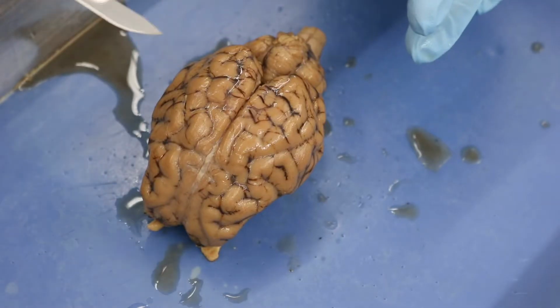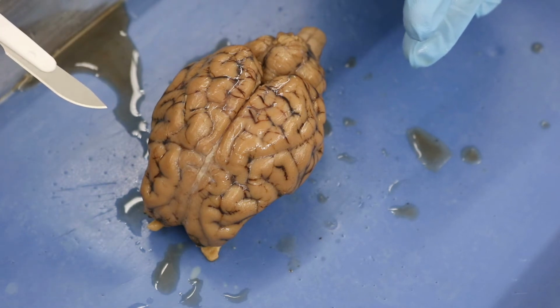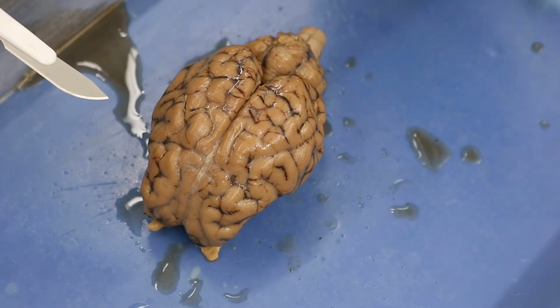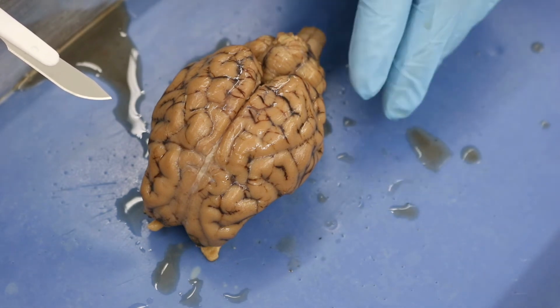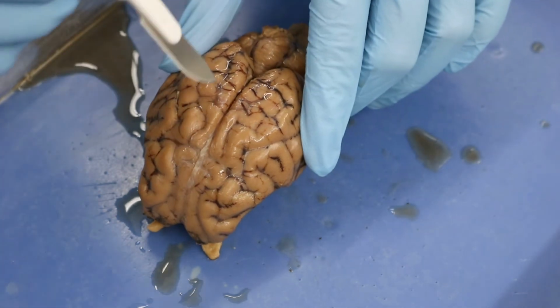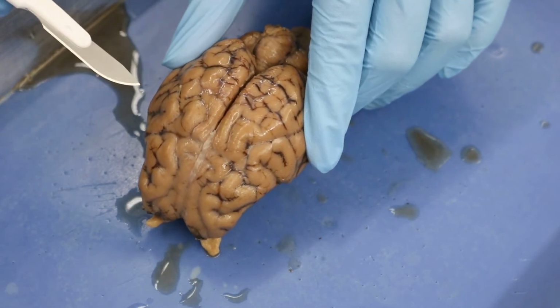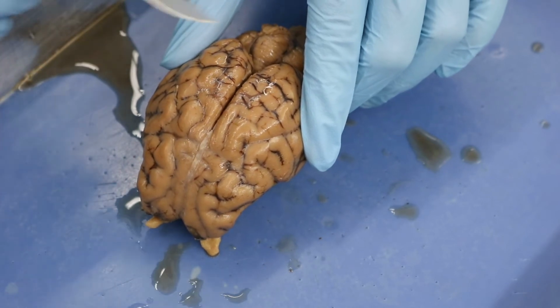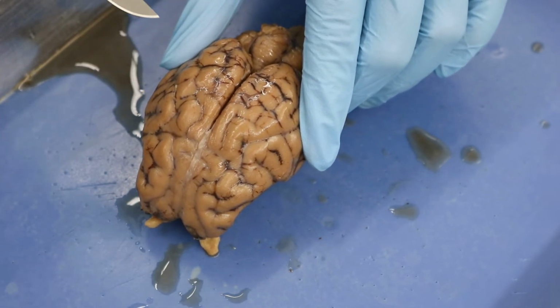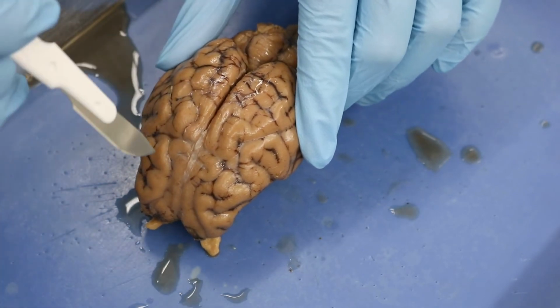All right, guys, so we have our scalpel. So we are ready to go ahead and do our cut. So 2 very important things whenever you are doing a dissection. Always, always, always cut away from yourself. You never know when the tissue is going to be a different consistency than you're expecting it to be, and all of a sudden the knife can get away from you. So you always want to cut away from yourself.